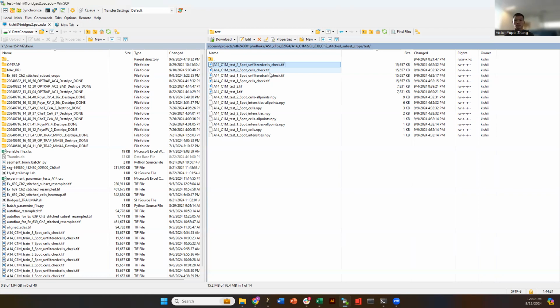But you want to just get the most out of it. A very critical point is that you have enough test or training images that well represent your data. You don't want to have images coming from small sections of the brain. So more images will be better, and more smaller crops will be better. It will take more time to train because of how many images you have to go through, but typically that will give you better results.